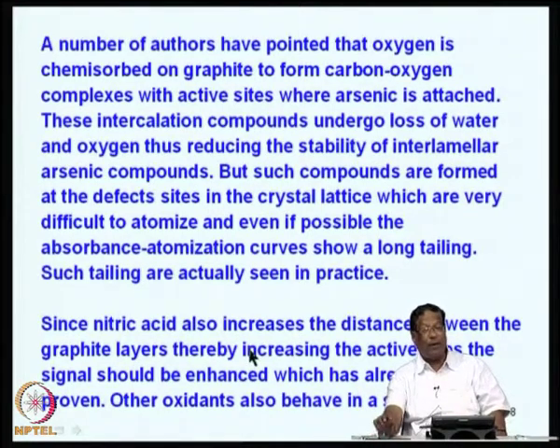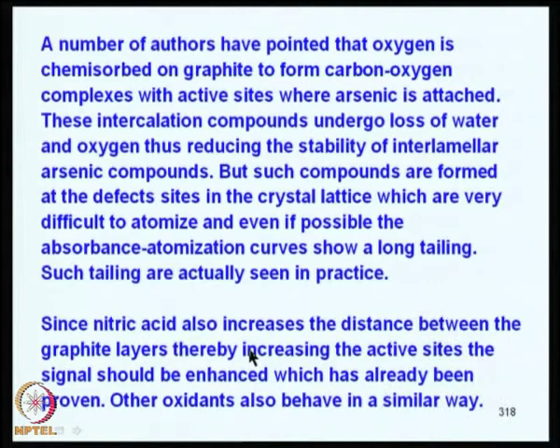Since nitric acid also increases the distance between the graphite layers, nitric acid gets into the graphite layers and then there is swelling, and it increases the distance between different graphite layers, increasing the active sites. The signal should be enhanced, which has already been proven. So, other oxidants also behave in a similar way.